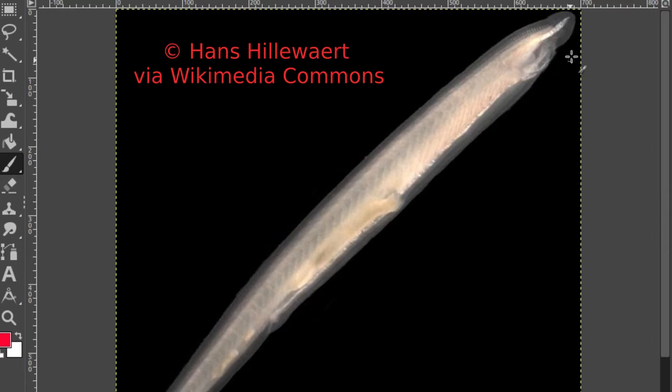They do have mouth parts, which are these bits here. And they seem to have quite a simple body structure. You can just about see the muscle segments here. But apart from that, they're fairly unremarkable externally.